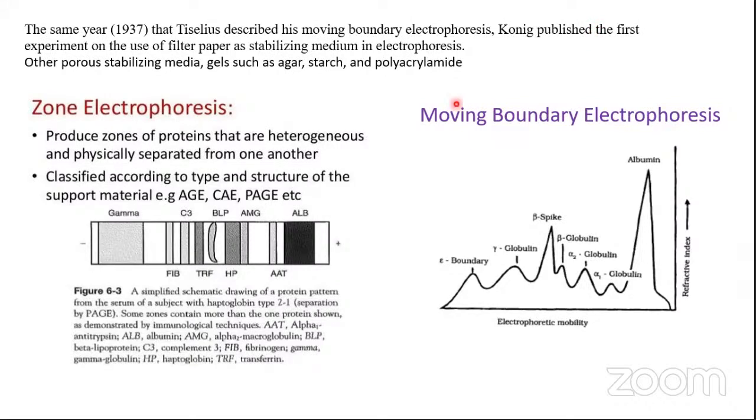So it's not exactly a problem during electrophoresis, but it is a problem when you stop the process, when you stop the current flow. Because now the molecules are saturating, or getting concentrated in a particular area, right? Once you turn off the current, they are free to move in both directions, because the solution here has meager concentrations of albumin.